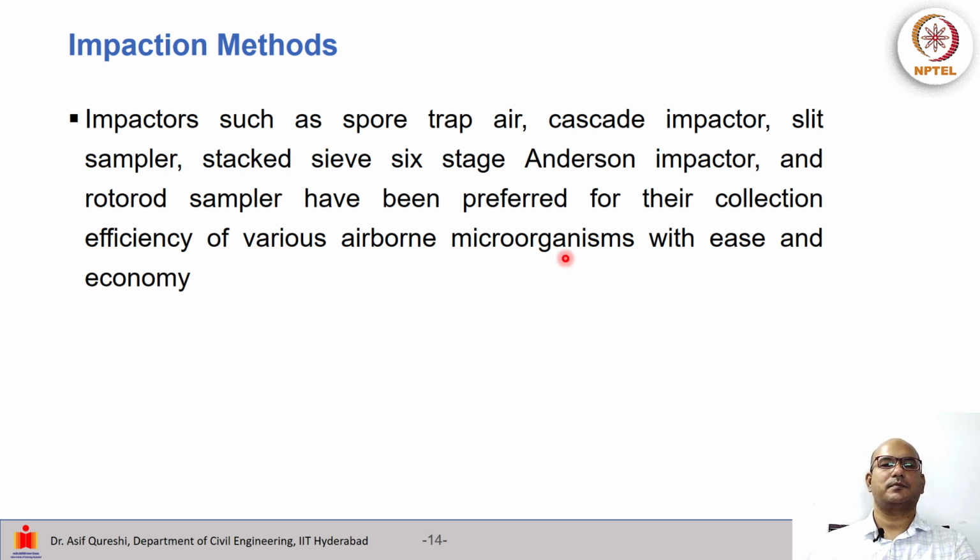They have been evaluated a lot, and it has been suggested that these types of impactors have a good efficiency of collection of microorganisms, meaning they are not more biased towards one or another. So they fairly collect the different microorganisms so that our collected sample is a representation of whatever is in the air.